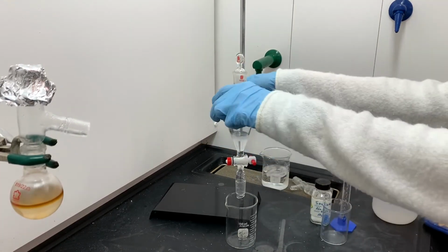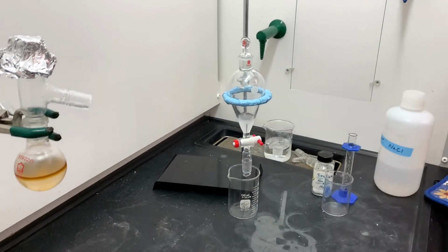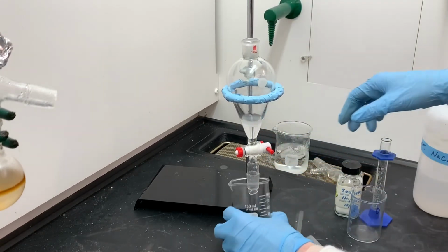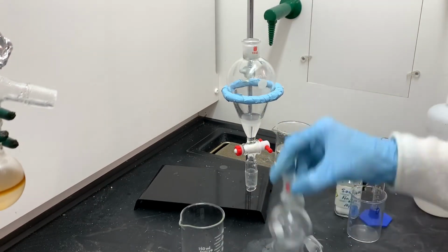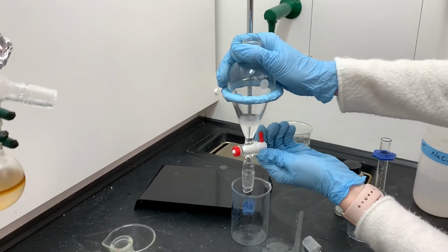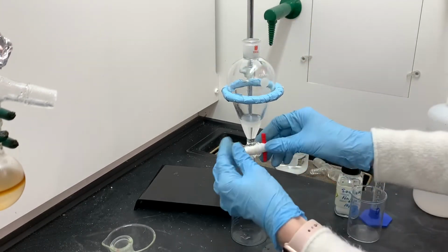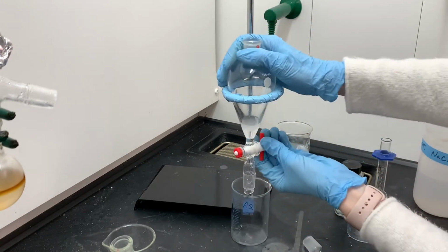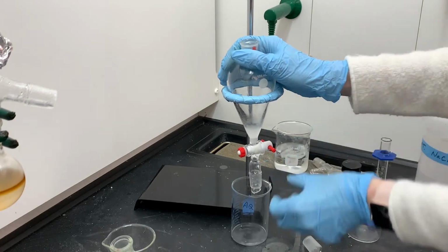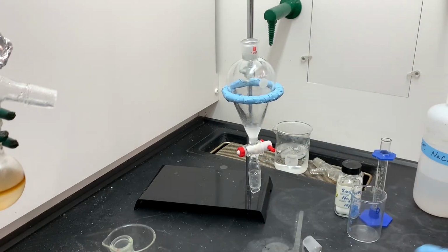I'm going to begin by draining the water out. We're trying to purify our product, which is the top layer. So I'm going to drain the water out from the bottom of the separatory funnel into a waste beaker. My goal is to try to get all of the water out. So I'm going to get a little bit of product drained out at the same time.